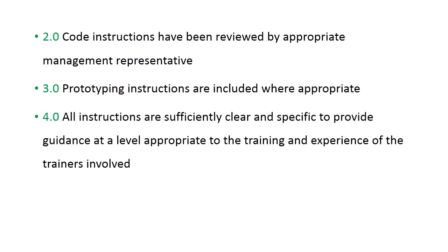Prototyping instructions are included where appropriate. Sometimes, prior to finalizing software, there is a procedure to prepare some working model or prototype of the actual software. This prototype would help us to know the advantages and disadvantages of the software which we are supposed to prepare. So sometimes prototyping instructions are also given to the coder, that we need this kind of software prototype before final development of the LIMS software.